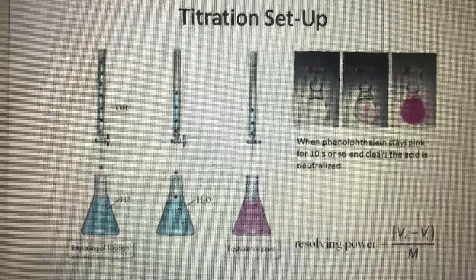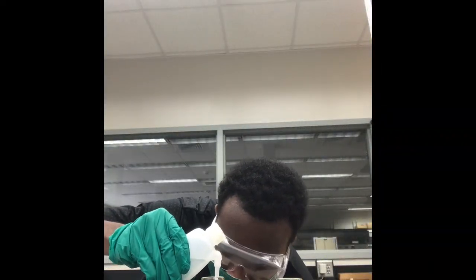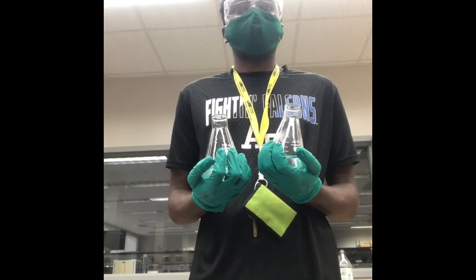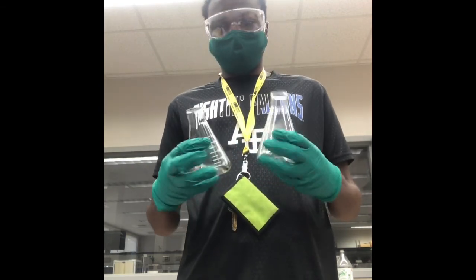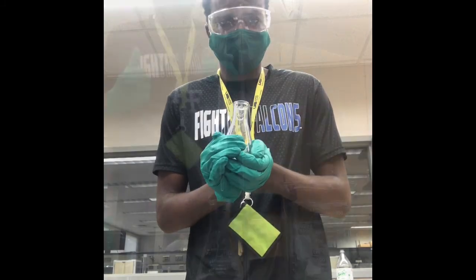Titration is a technique to change the pH of a solution to determine the unknown concentration of an analyte. Here we use KHP, we weigh it out, then we add water to complete the solution. It takes a while to dissolve, so there are methods of hurrying up the dissolving of it in water, like transferring heat from your hands to the solution, and this speeds up KHP getting dissolved.